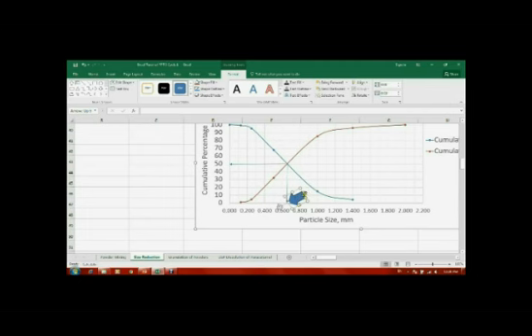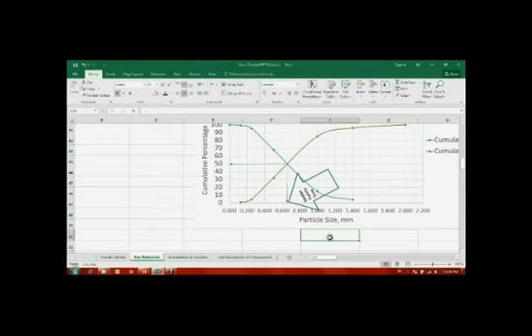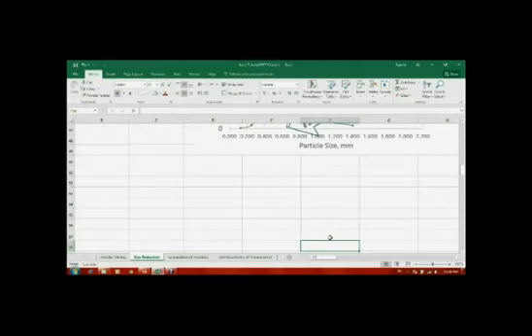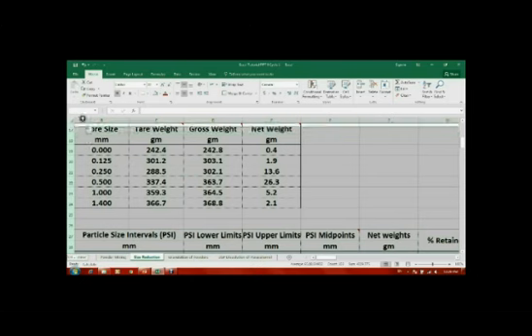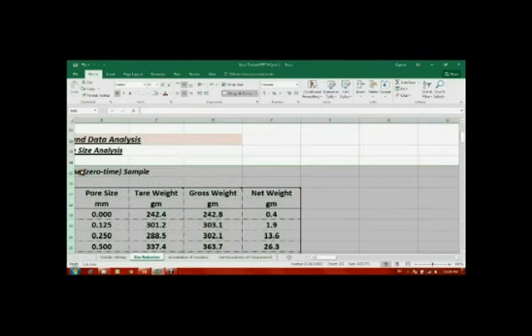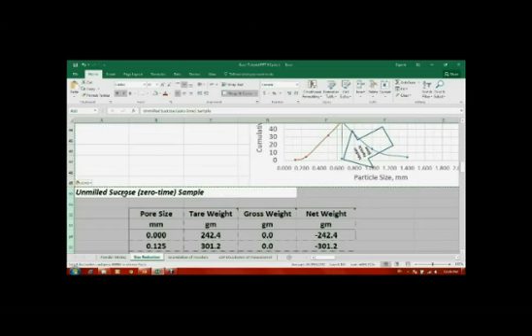What if we only have the values for the cumulative percentage over size? Can we estimate the median particle size? Yes, we can, because simply these two curves we are plotting do represent the same data and will have the same median particle size.